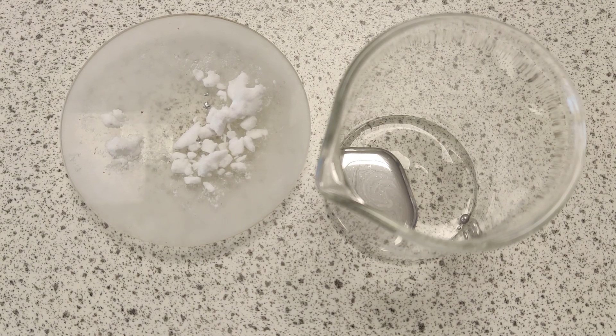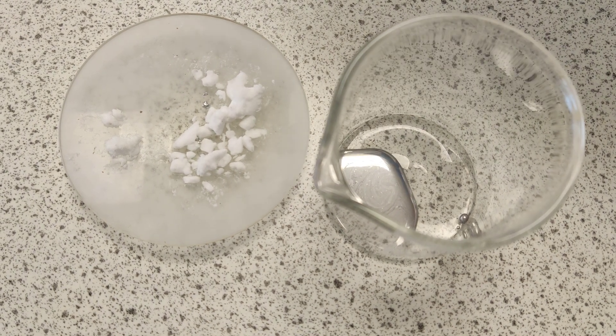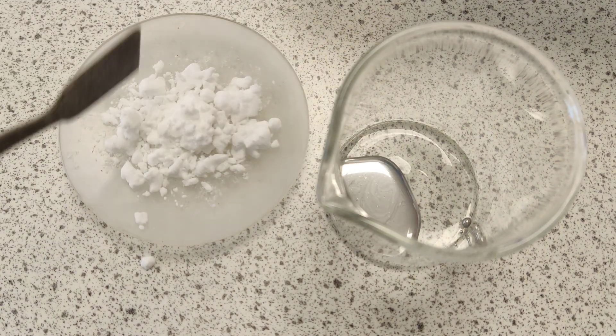Okay then YouTubers, this is possibly one of the most exciting little practicals you're going to see around on the internet. I've got some dry ice here, CO2, so I'm going to drop that into my watch glass. So there we've got dry ice.